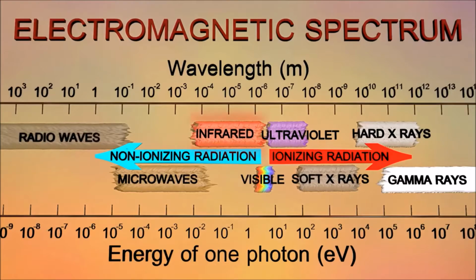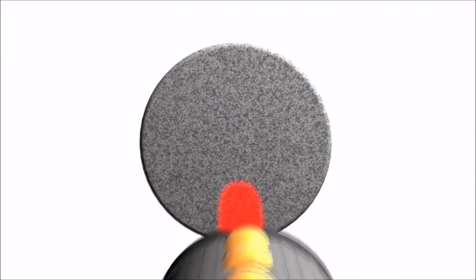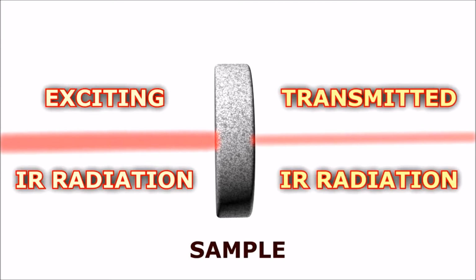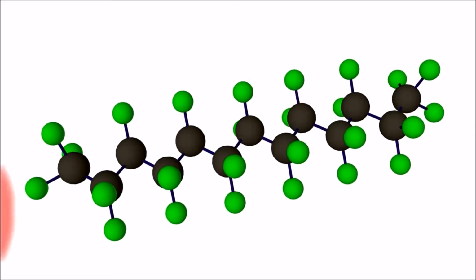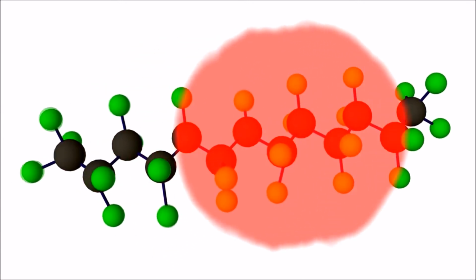In infrared spectroscopy, a sample is irradiated with polychromatic infrared electromagnetic radiation. As a result, some of this radiation is absorbed by the material, and by studying the spectrum of the transmitted radiation, it is possible to obtain information about the substrate that we want to study. Anyhow, there is a reason why the radiation gets absorbed by the studied substrate.